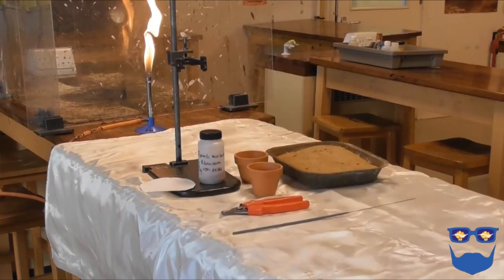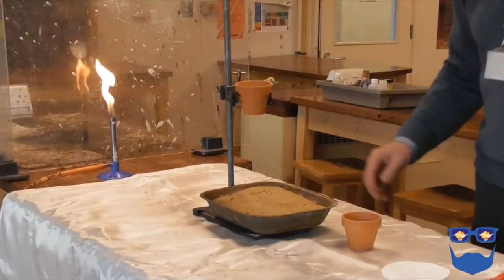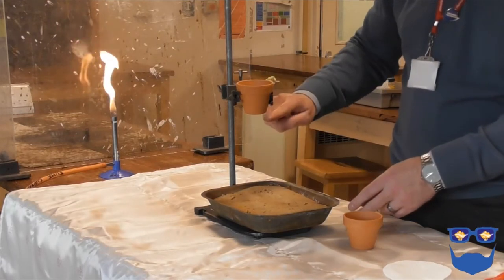In the past we used to use an igniter mix, but you'll need an explosive licence now if you want to continue with that method. Clear a work area and put your heatproof mats down to protect the desks — I use an old fire blanket. Ask the students to move back; try to have an empty desk between them and the demonstration.